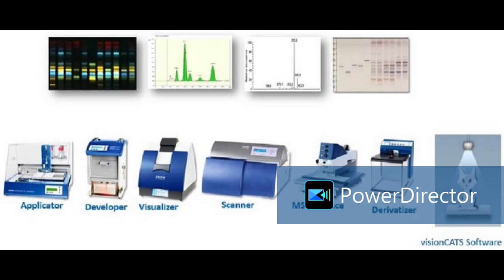This is the mass spectra after TLC-MS hyphenation. We can hyphenate HPTLC with mass spectrometry, and this is again one image under white light. Not only these four, but many other things like photo, chromatogram, along with TLC-MS spectra, along with absorption spectra. Everything will come in your final report.